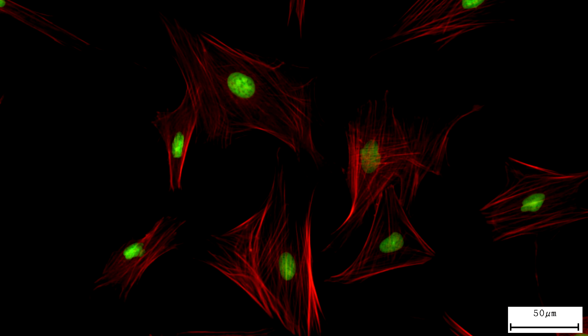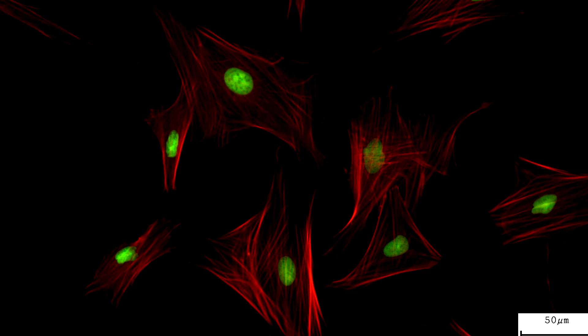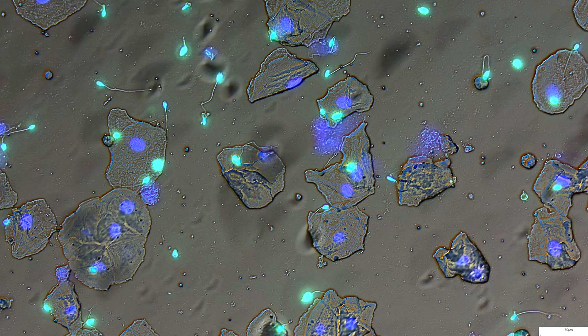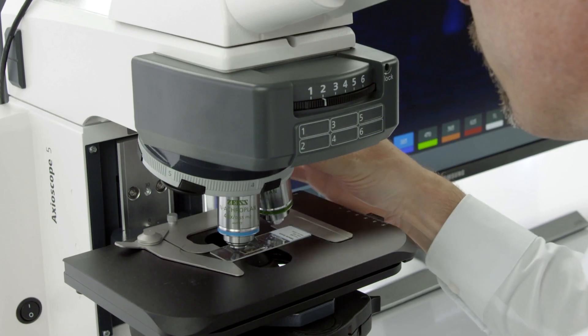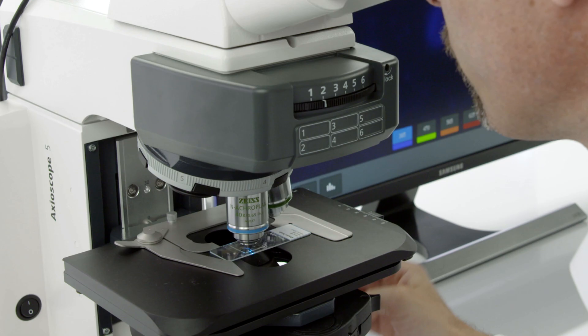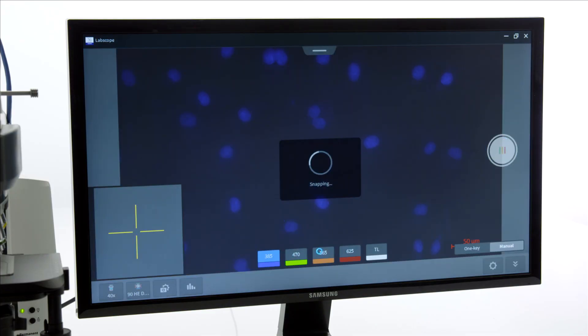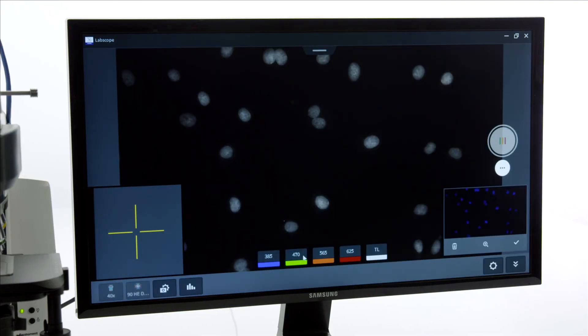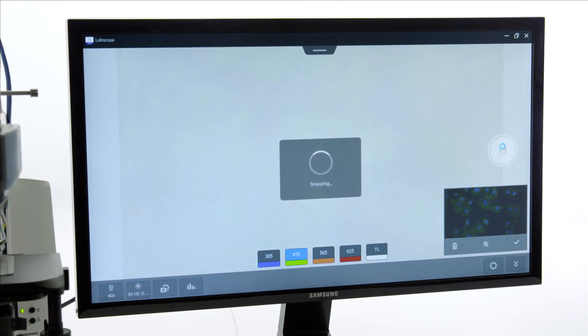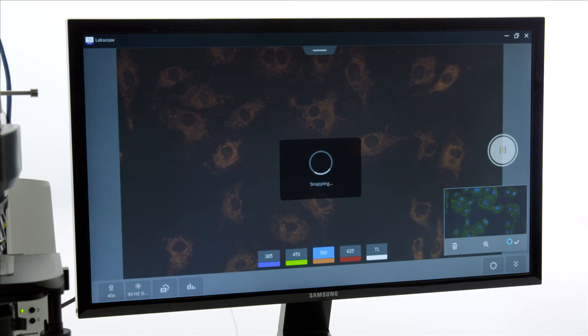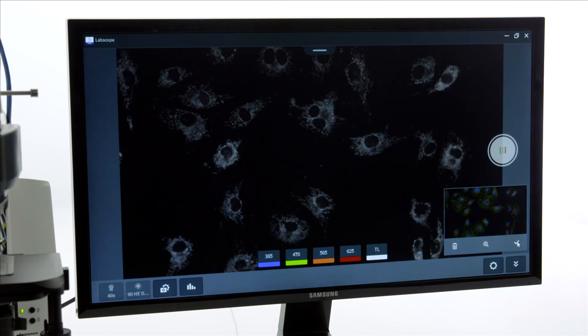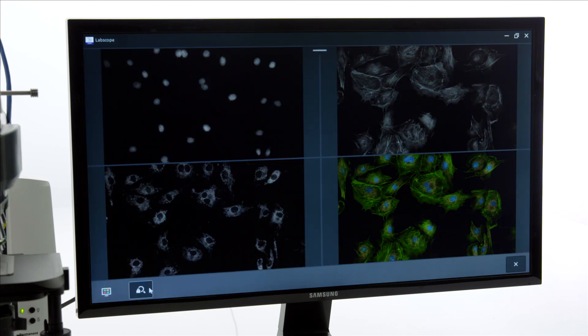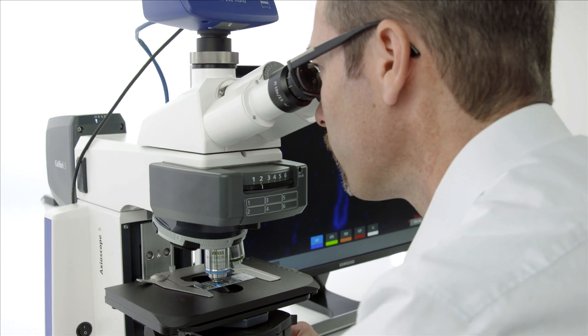Especially with manual microscopes, this procedure can be cumbersome. Imagine there would be an easy and effortless way to acquire up to four fluorescence channels and one transmitted light channel. Here is how it works.